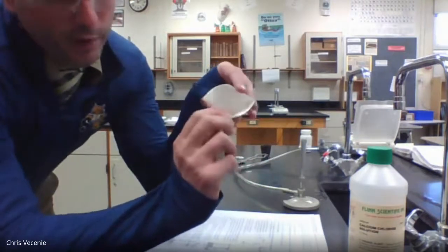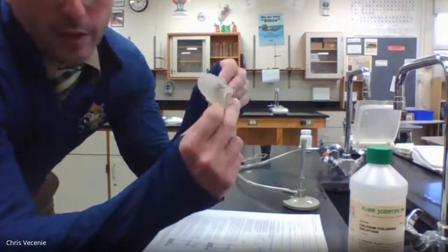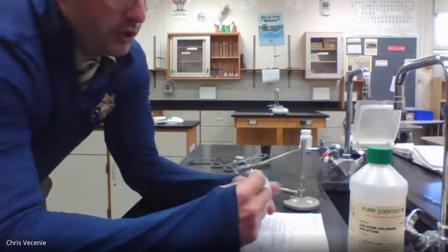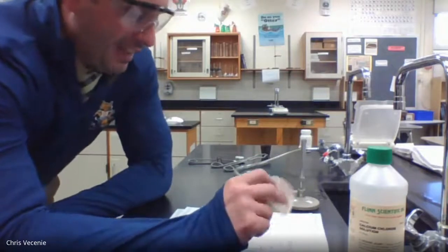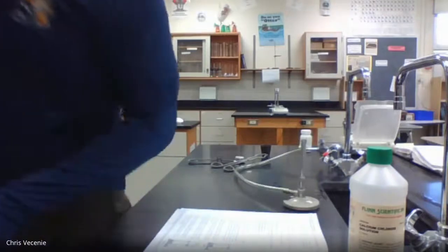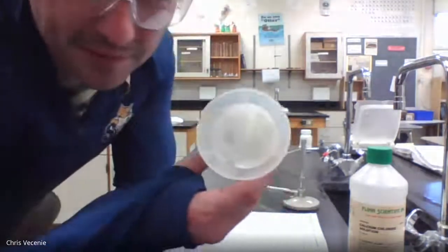Middle's no good because it's open on both sides. And you've got a piece of filter paper for the bottom. It doesn't matter which one of those sides we use to filter. I'm going to wet the paper and stick it into my funnel. When I do that, it's going to look like that.